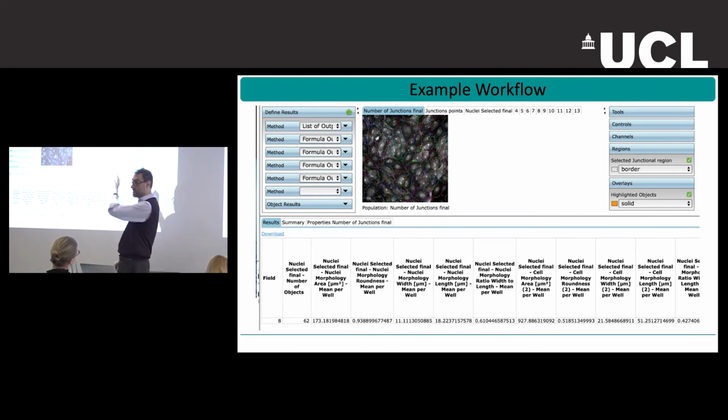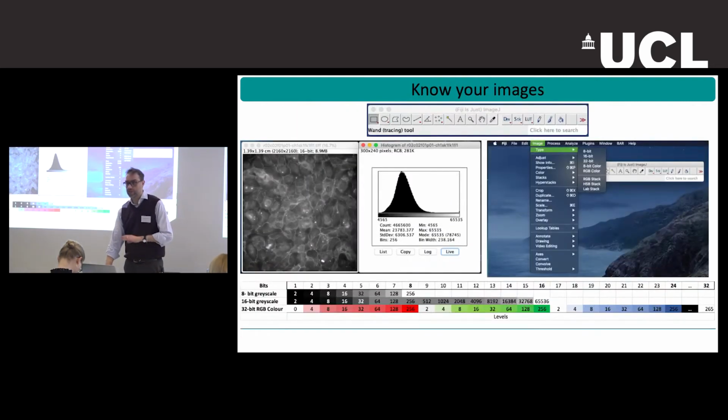You just use them as a service to find certain characteristics, but perhaps you want to limit these to those parameters that are biologically meaningful to you. You filter them, you put them in a data set, and then perhaps you post-process with some data analysis technique. You can use software for multivariate data analysis to obtain principal component analysis, clustering, and other things. Or more classical questions like, if I give VEGF to the cells, how many dots are around? There might be less, there might be more. And this closes the first part.